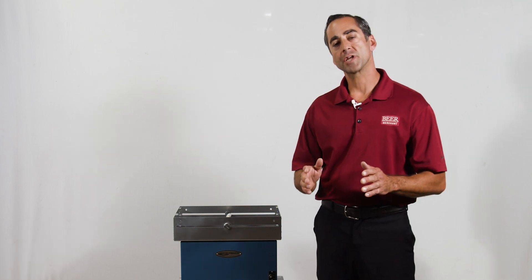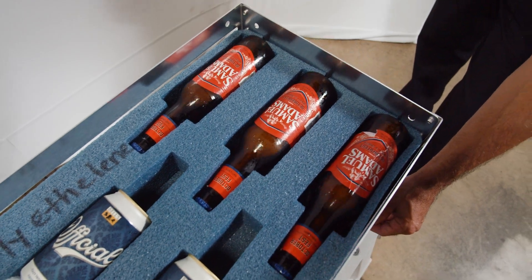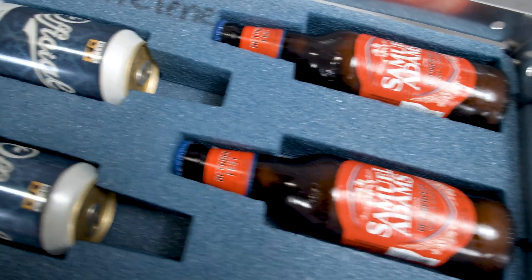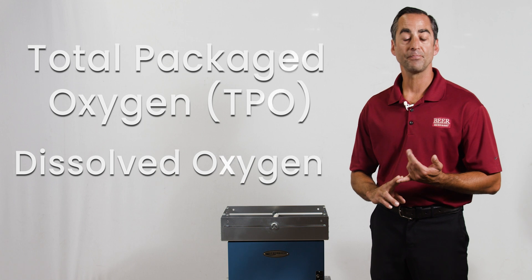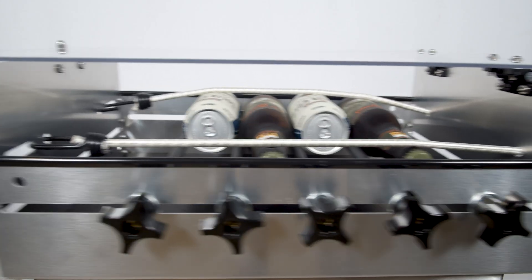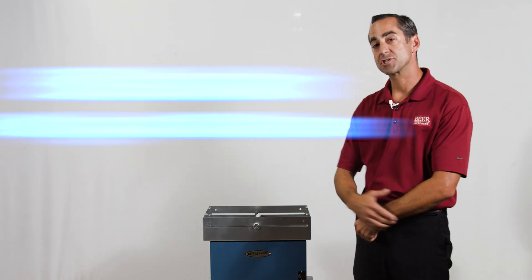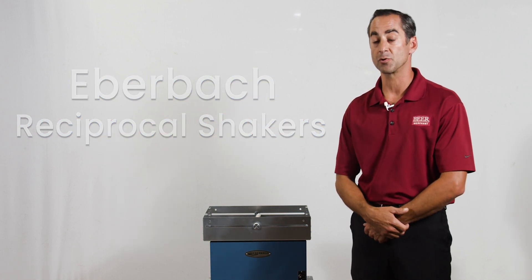The beverage industry understands the importance oxygen has on their final product. It's common practice when canning or bottling for a brewery or a winery to run a series of tests to help calculate total packaged oxygen as well as dissolved oxygen. These tests will help ensure consistency of quality with every batch. Our Eberbach shakers have helped provide consistent, repeatable results for our customers for many years all over the world. This video will help demonstrate some options and how to use it.